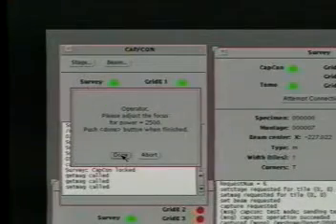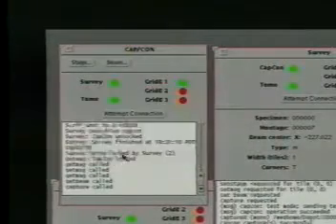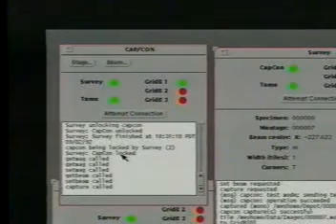We haven't reached that point yet. So currently, when it becomes time to focus or do those other types of operations, a requester appears on the workstation in San Diego asking the operator to please focus, and then click on a little button to tell us that they've finished focusing. At that point, the automatic acquisition of the stereo pair can proceed.